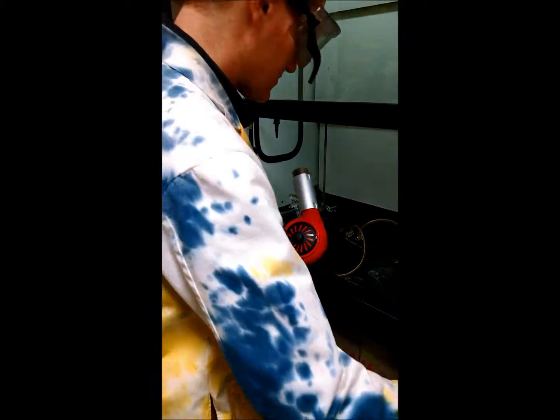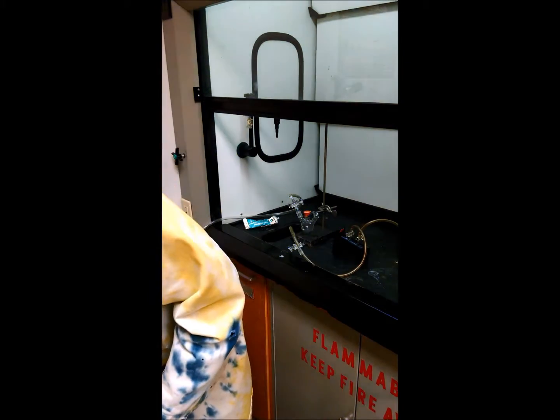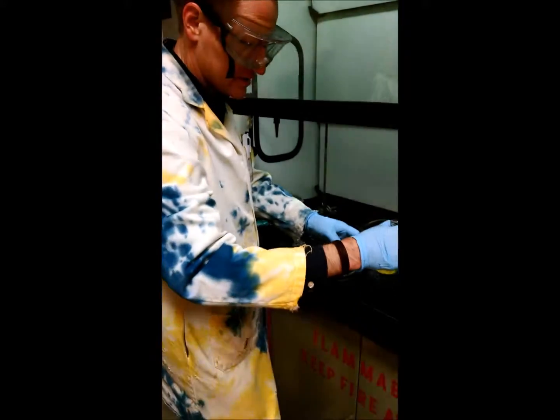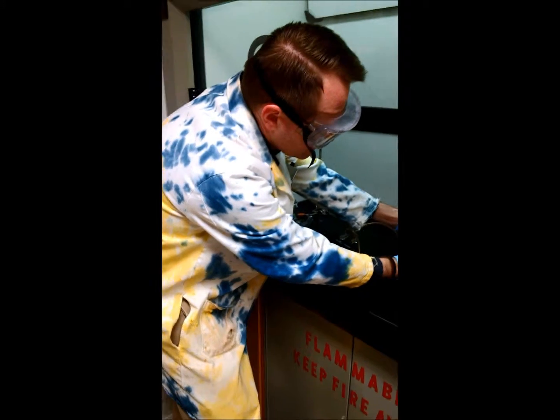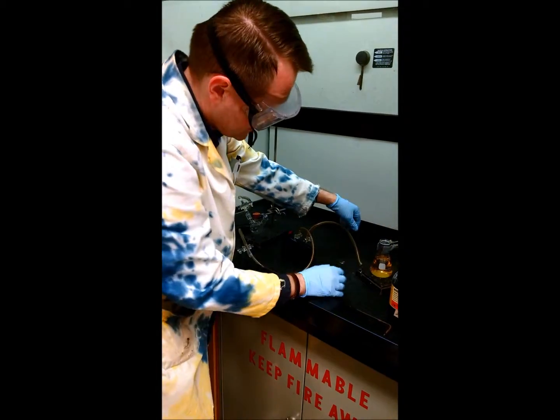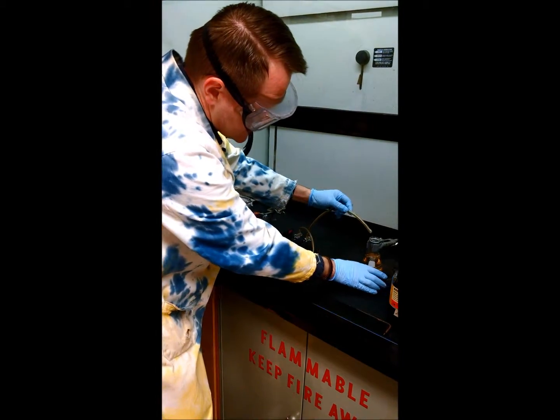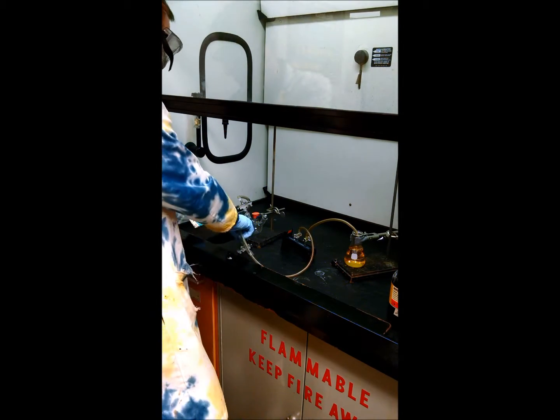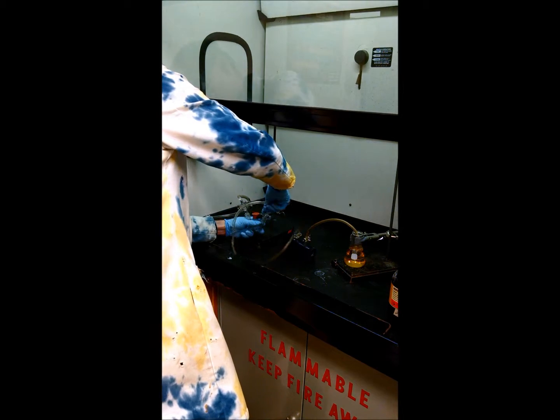Okay, so we're done with attaching the tubing. We'll have our indicator solution — and this is aqueous — so we want to make sure it's kept clear away from our IR cell. We'll tape this exit tube in here and secure it up.